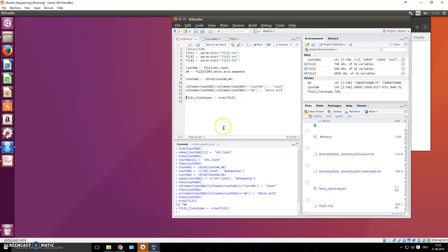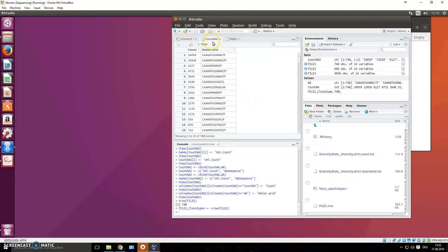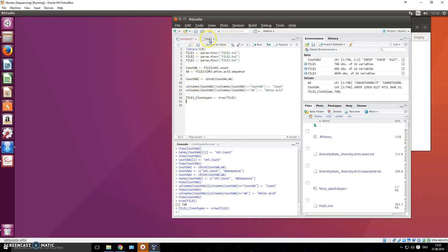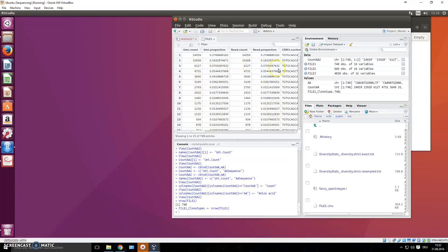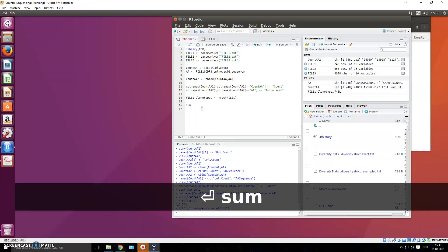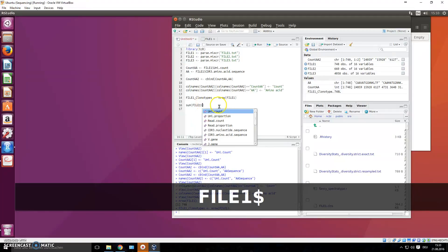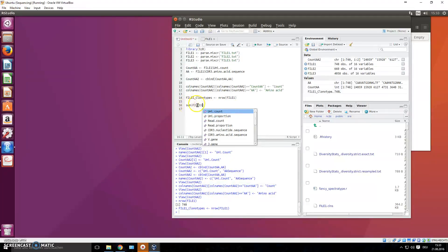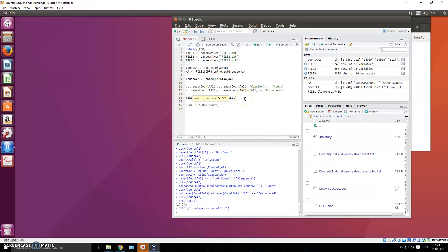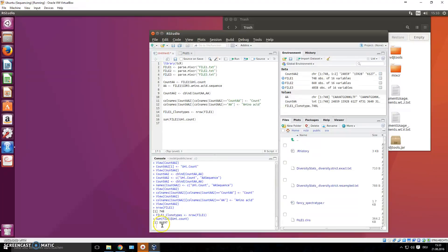You might also want to know how many total reads are in the whole sample, not just the number of clonal types. You can do this by writing sum(), then inside the brackets write file_one$count to specify which column to sum. Press Ctrl+Enter and it will print the result - there are almost 87,000 sequences or reads in the sample.